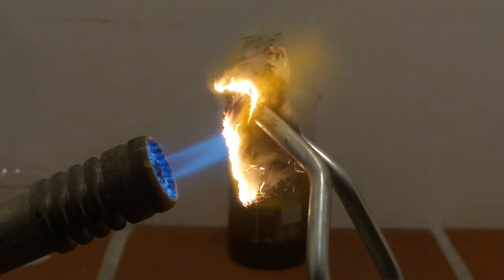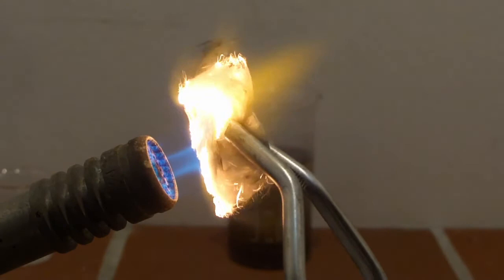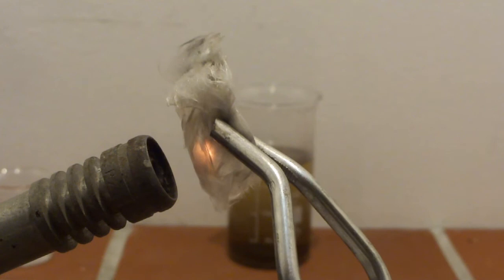Even though this process is a bit lengthy, if you have to start from elemental platinum, it is the proper way to do it. There is, however, a shortcut. We could apply the same method that was used in former times to prepare platinized asbestos. We simply substitute the asbestos for quartz wool. For this, prepare the chloroplatinic acid just as we demonstrated. Now, dissolve the solid chloroplatinic acid in ethanol.